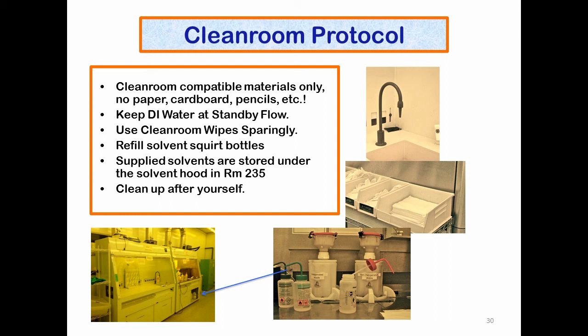Cleanroom protocol. Be aware that cleanroom compatible materials are only allowed in the cleanroom. For example, no paper, cardboard, or pencils are allowed as these generate excess numbers of particles. Keep the deionized water flowing at a standby rate in each wet sink area. Do use the cleanroom wipes sparingly as they are rather expensive.